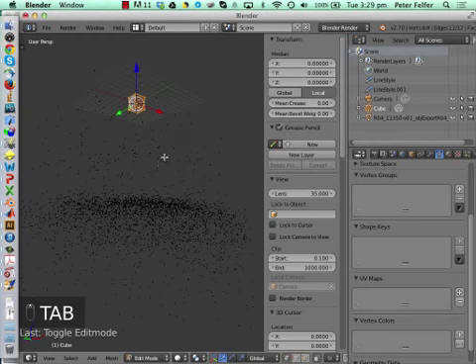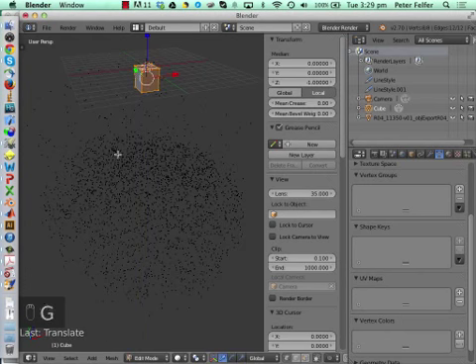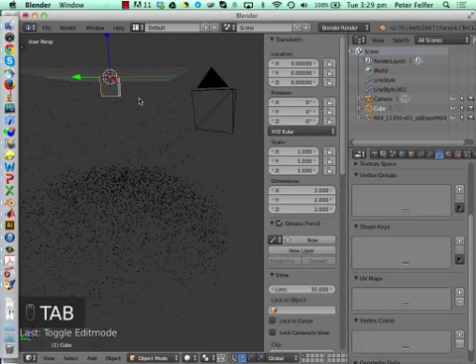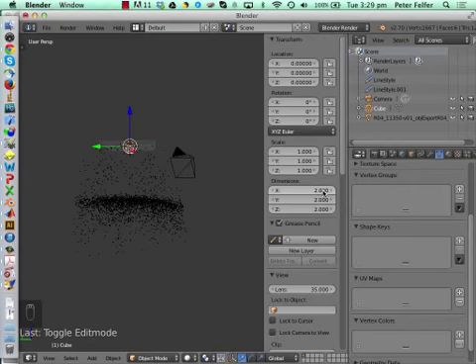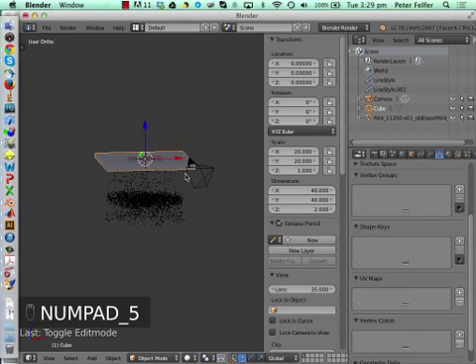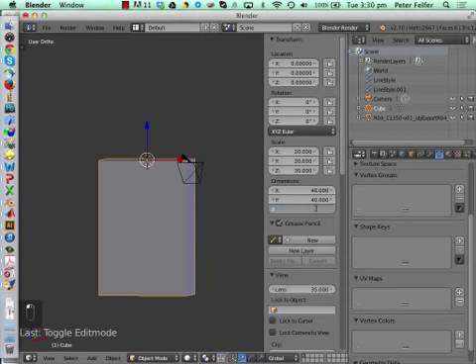And then next go into edit mode and move the cube down 1 Blender unit, so that the top face of the cube is where the origin is. And then I go outside and I'll make it 40 times 40 times whatever height. So we'll make it the dimensions 40 times 40 times. Is that about right? No, it's too big. No, that's actually pretty much right. 40 times 40 times, no, maybe not 60, 30.